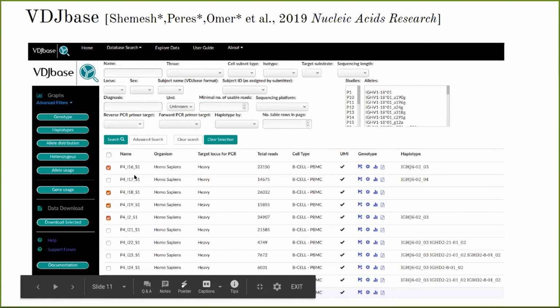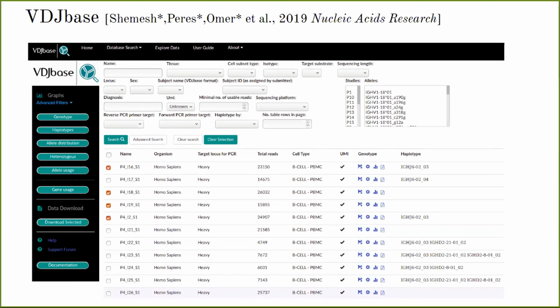Using these advanced filters, this is a set of drop-down tag lists. A user can filter all the visualization according to specific genes, alleles, or certainty levels of inference for each genotype or haplotype decision. For more details on how to use it, you can find the tutorial videos on the user guide page.